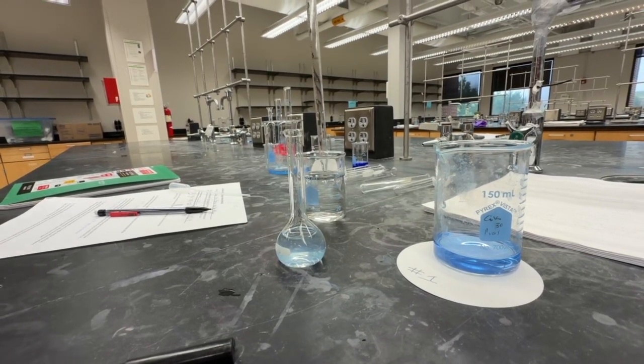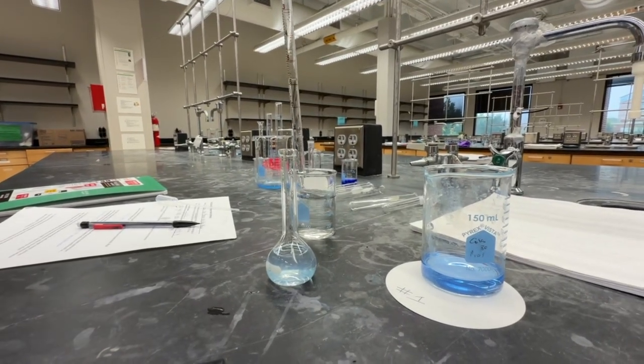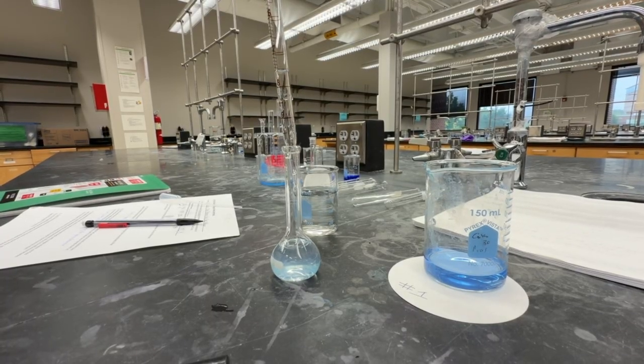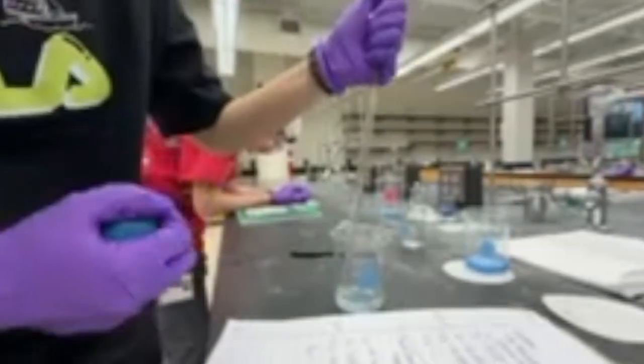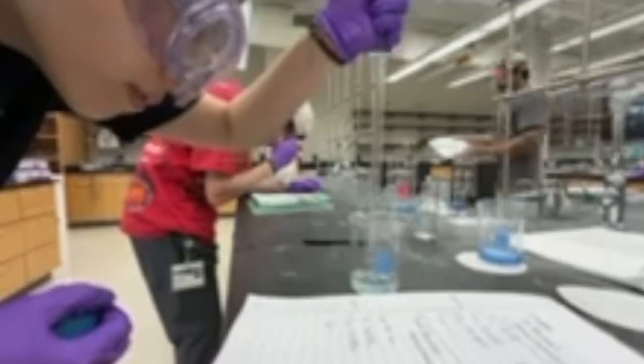I am using a transfer pipette to transfer the solution from the beaker to the volumetric flask. I draw the solution up to the 7 mL mark, then carefully release it until the meniscus reaches the 9 mark. That transfers exactly 2 milliliters of solution. I read the meniscus at eye level to ensure an accurate measurement.